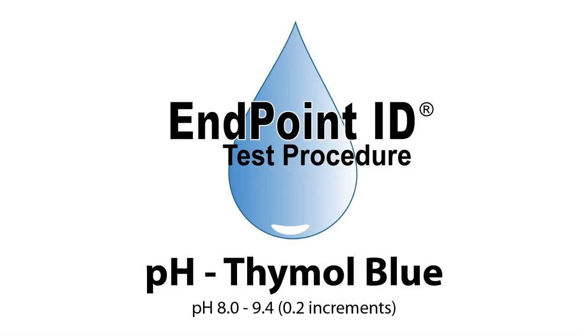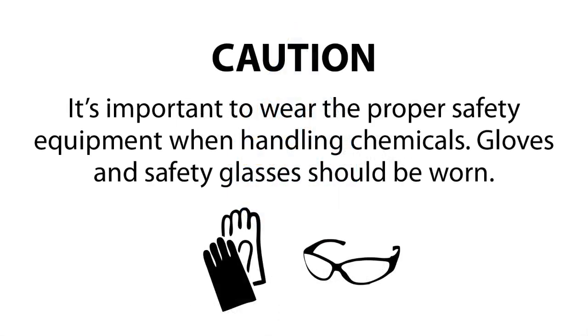This is a demonstration of a Thymol Blue pH test kit. Before beginning your test, it's important to make sure you wear the proper safety equipment. Gloves and safety glasses should be worn.